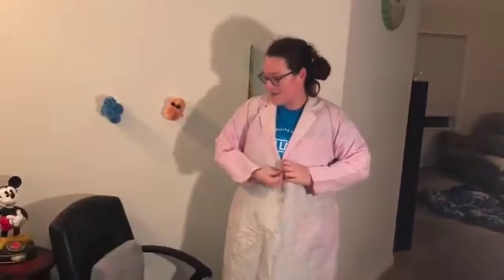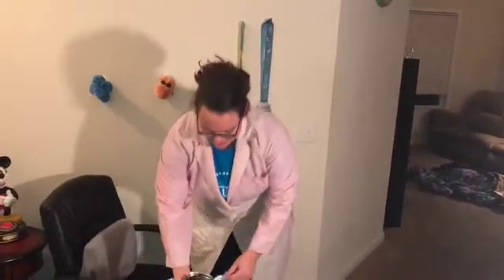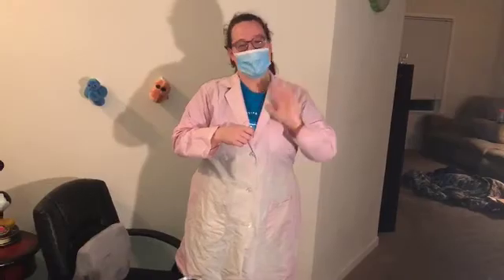And for now, just remember to always use your units, as well as safety first: lab coat, mask on, hair back, water stays in the office as there's no food and drink in the lab. And as always, science can be fun if you know how to investigate it. Enjoy your day, and thank you for tuning in.